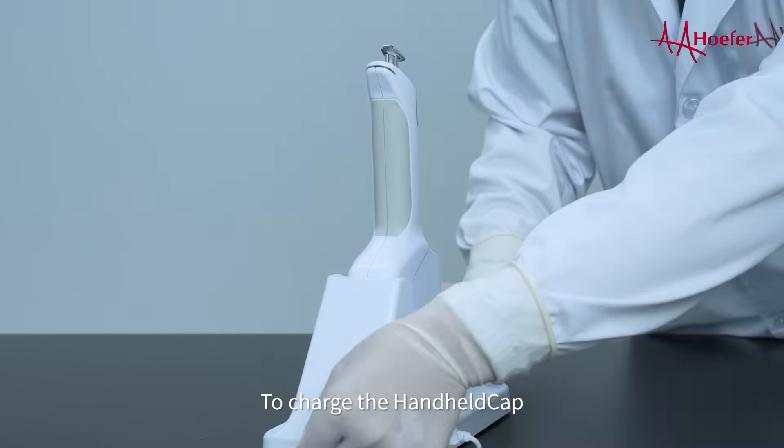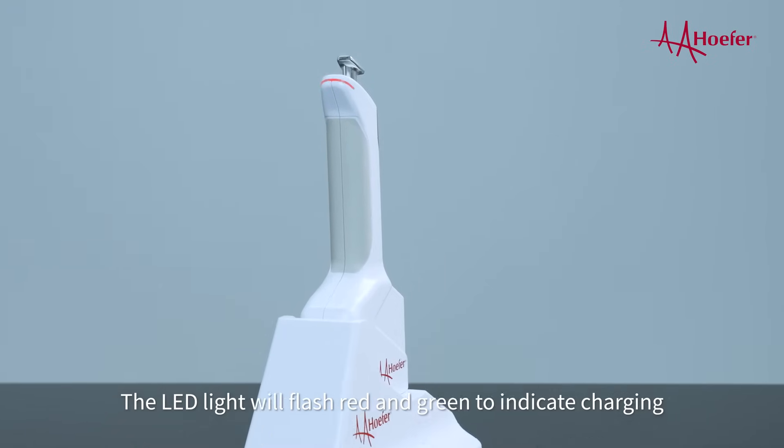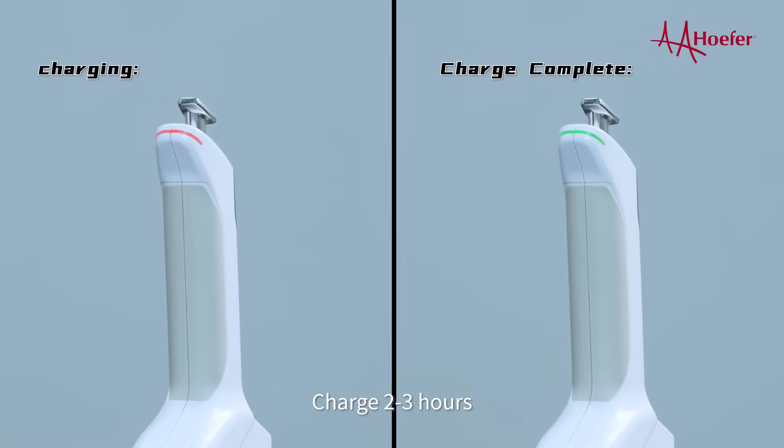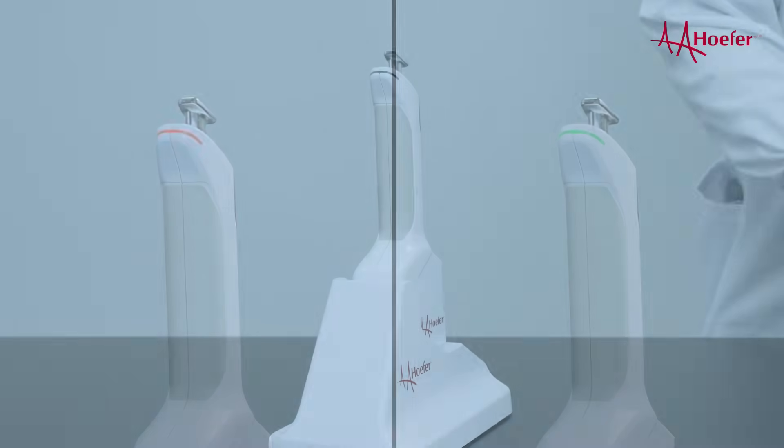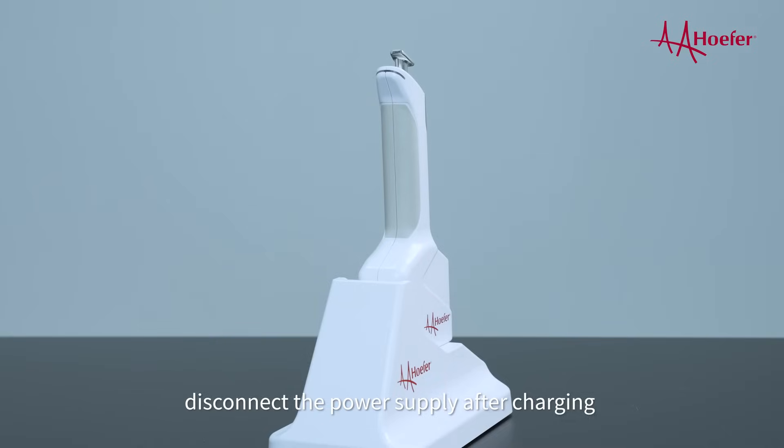To charge the handheld cap, the LED light will flash red and green to indicate charging. Charge 2 to 3 hours. When the light stays green, charging is complete. For optimal battery health and longevity, disconnect the power supply after charging.